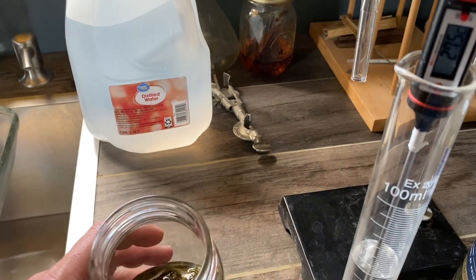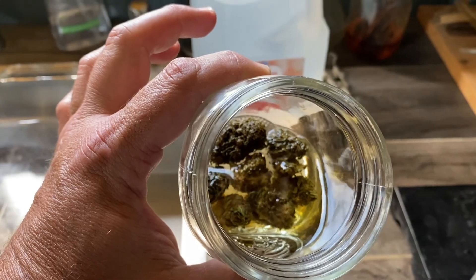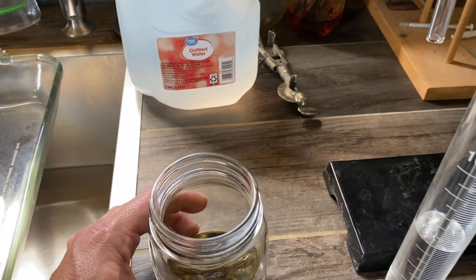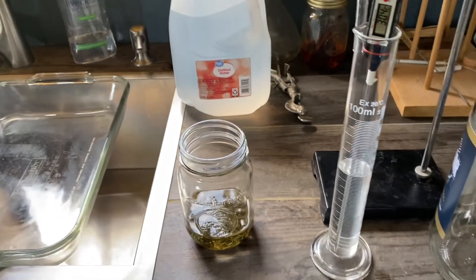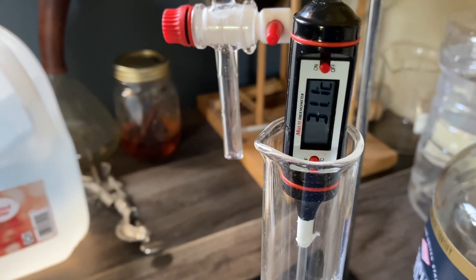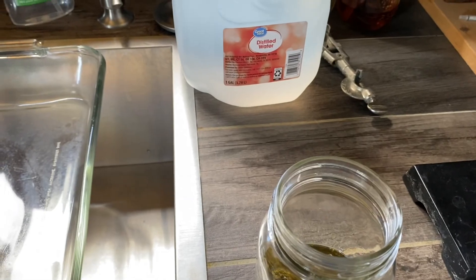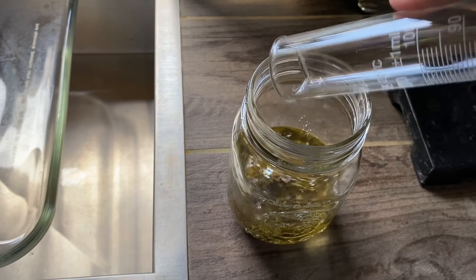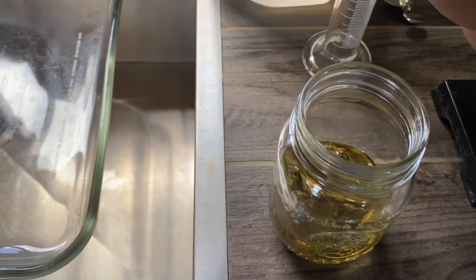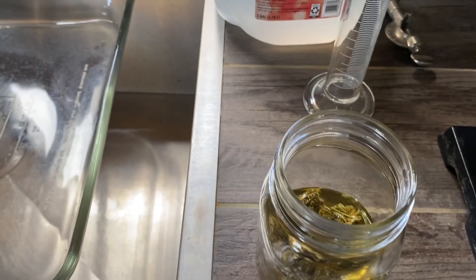It'll take a minute to get to temperature. You can see it's already beginning to extract. The alcohol is at about 31 degrees Celsius. Now we're going to use 160 milliliters — this should be about right because we're less than the 500 milliliter total of this particular separatory funnel.